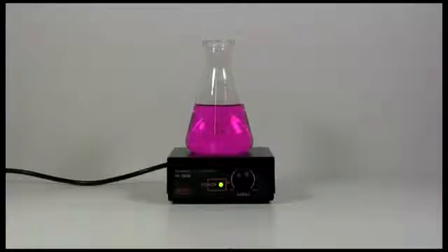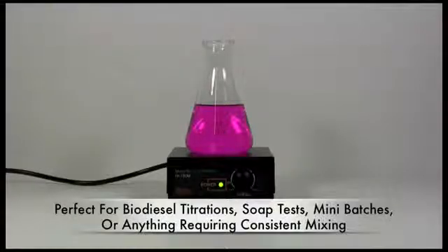We'd like to introduce you to our median line magnetic stirrer. This one can handle a capacity of one liter, has a speed range of 100 to 1000 RPMs, can handle liquids or an environment of 32 to 122 degrees Fahrenheit or 0 to 50 degrees Celsius. We're going to show you how well this works.